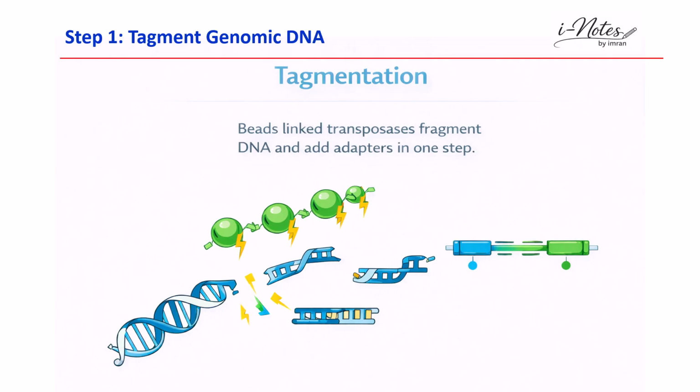Most of the protocols being used these days utilize tagmentation for the fragmentation of genomic DNA as well as adding the adapters to the fragmented DNA, rather than utilizing the fragmentation and adapter ligation steps separately.